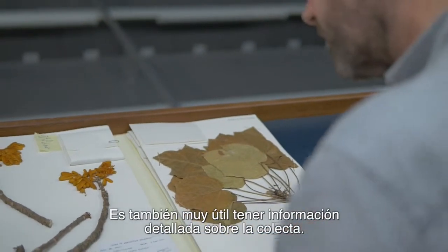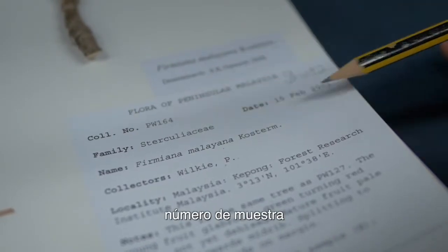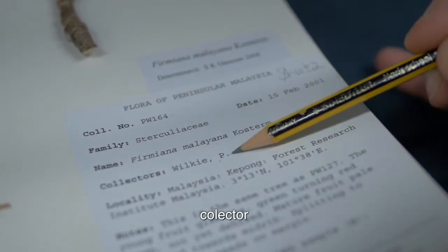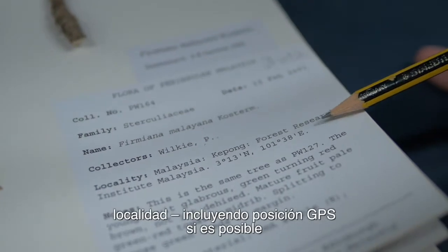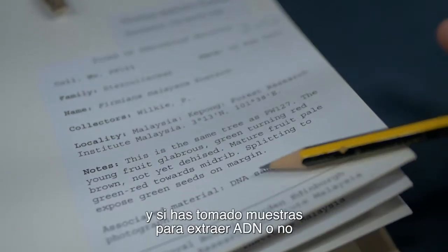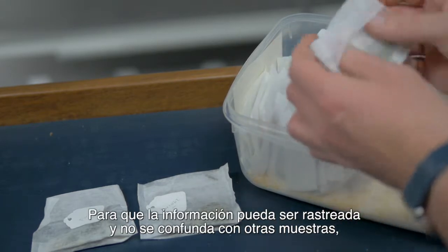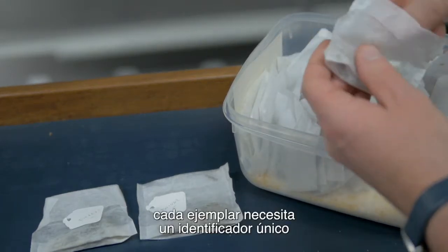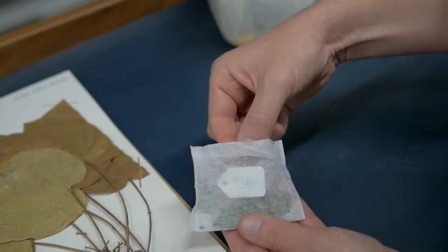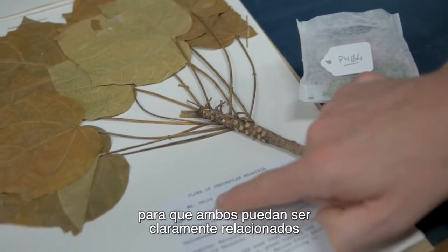It's also really useful to have detailed information about the collection, such as collection number, date, scientific identification, collector, locality including GPS locality if possible, general notes on the plant itself, and whether DNA has been collected or not. In order that information can be traced and not confused with other collections, each specimen needs a unique identifier, usually in the form of a collection number associated with the collector name. It is very important that the herbarium and silica dried material are given the same collecting number so that they can be clearly linked to each other.